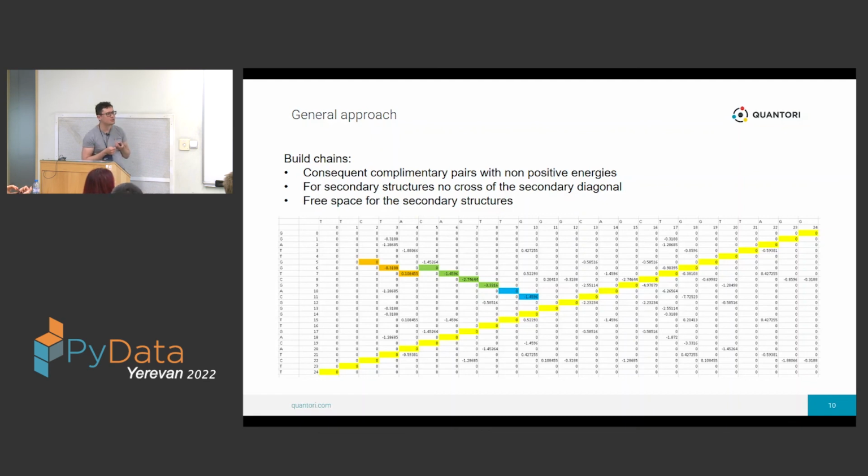So yeah, weight is energy density. Thank you. So the less energy density, the better. Less, you mean in minus? Minus, yeah, because energies are negative, and the more negative energy is, the better. It means that we form stable structures.